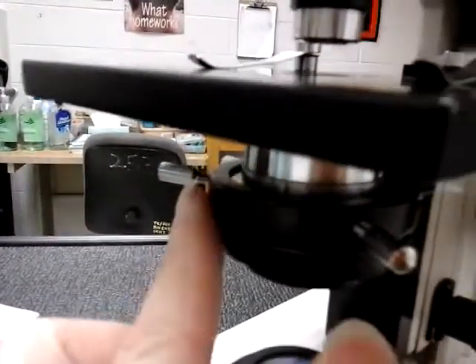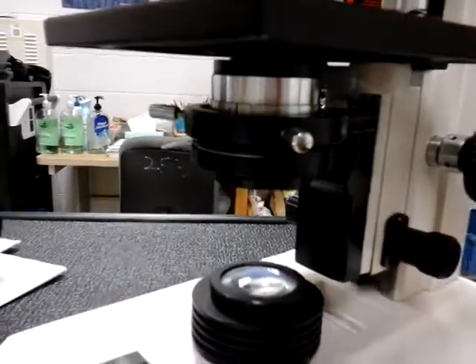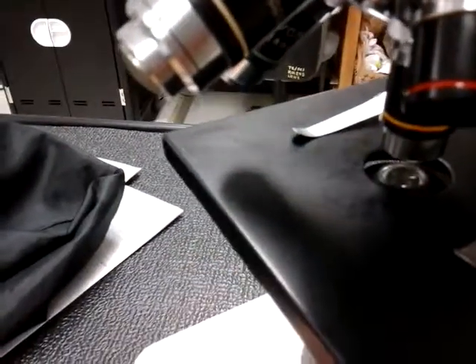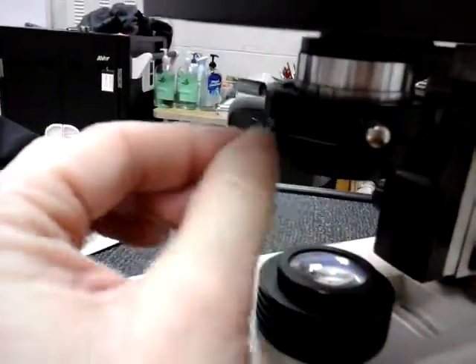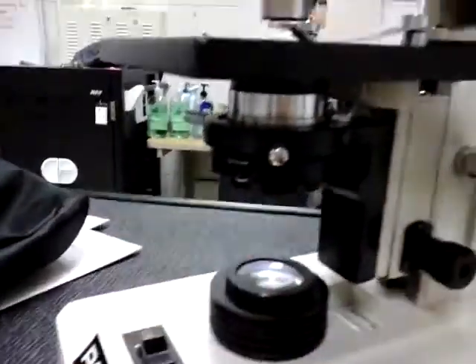So you've got this little lever right here. And this little lever is called the diaphragm. It's also called the iris. Now the iris is the colored portion of your eye. And you know your iris can get smaller and your iris can get bigger. Well, what that does is it regulates how much light. So if you could see this when you move the iris back and forth, this opens and closes. So it allows you to dim the light. So sometimes if you get the microscope and it's turned on and you can't see anything, move that lever because it might have accidentally got closed.